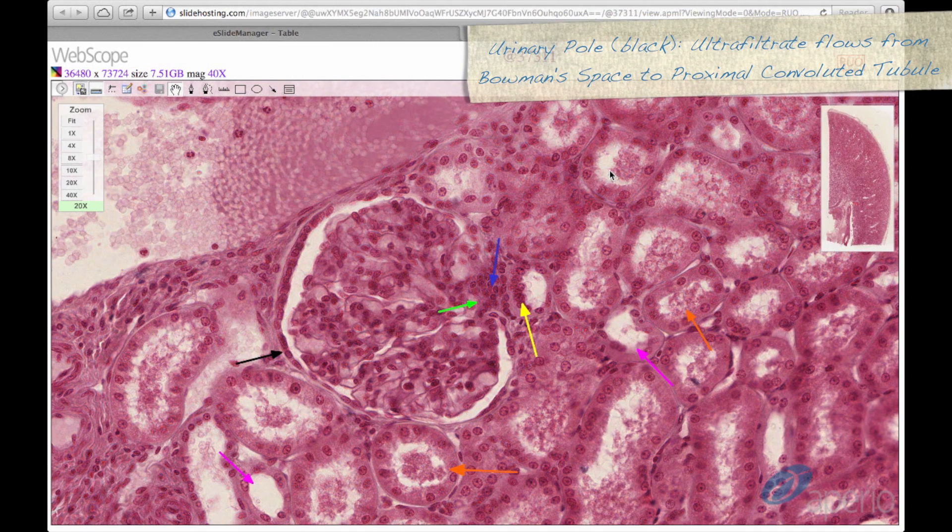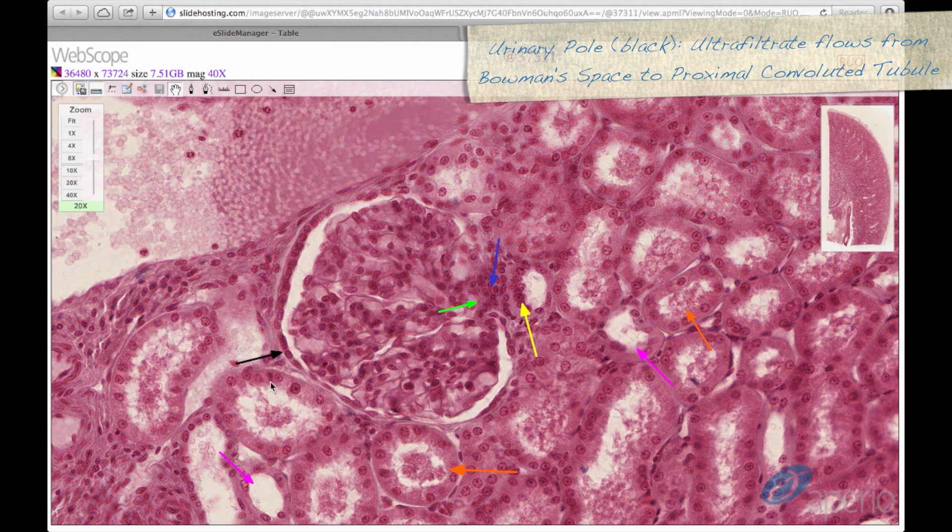The urinary pole, seen here at the black arrow, is opposite the vascular pole, where the ultrafiltrate will flow from Bowman's space into the proximal convoluted tubule.